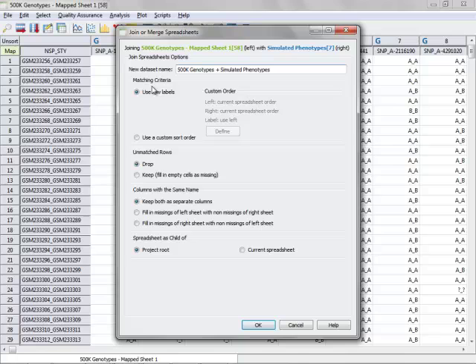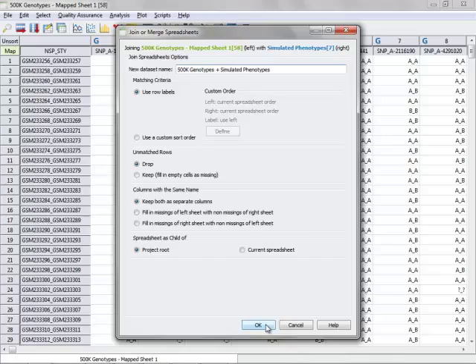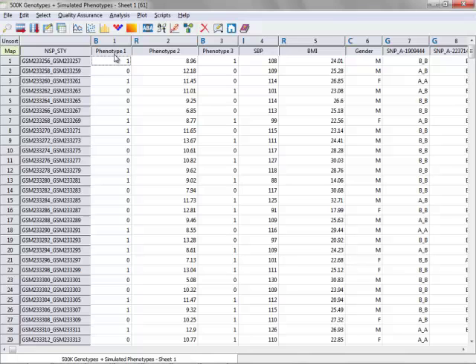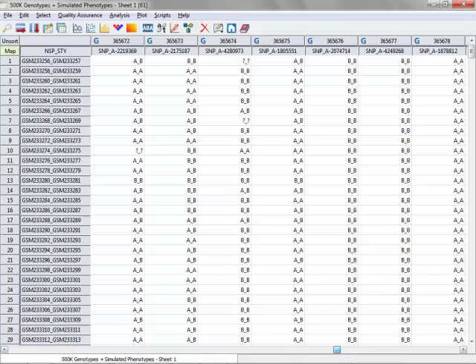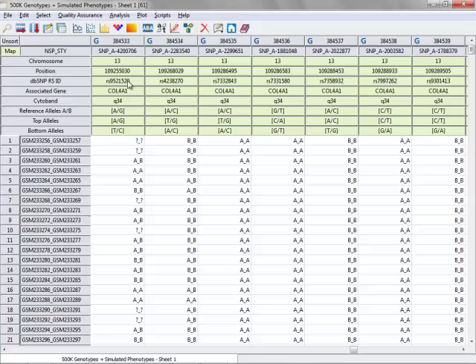I'll leave the other parameters here as the defaults and click OK to join. This will go through and then join the two spreadsheets together. Now you can see that I've got the phenotype information here as the first six columns, followed by the genotype information throughout the spreadsheet. And once again, on the map button here, I can see that there's map information for the genotypes.